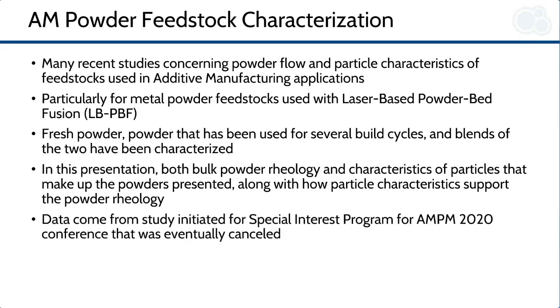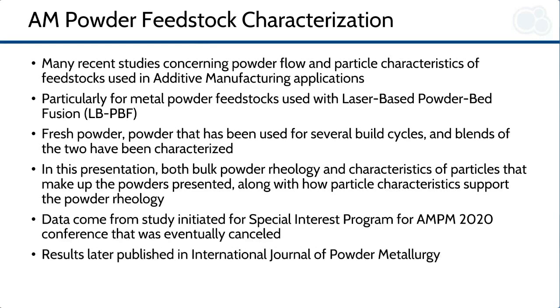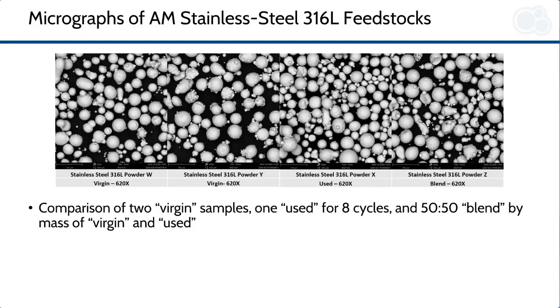The study was originally conducted in support of a special interest program to be presented at the 2020 AMPM conference. The conference was canceled after the testing was complete. Results of the study, along with discussions, were published in Part 4 of Volume 56, Fall 2020, of the International Journal of Powder Metallurgy. SEM images were produced for the 4 powders characterized in the recent study.